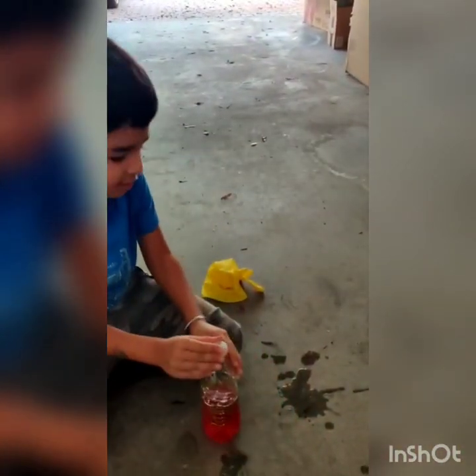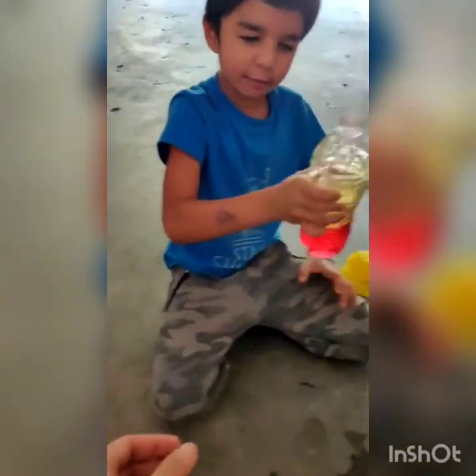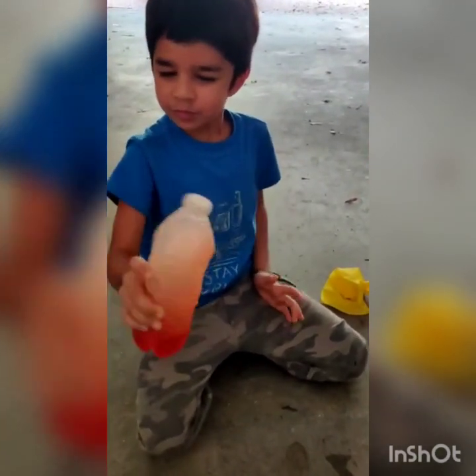Step 4, close the cap and shake well. They're separate right now, right? Let's see what happens when you shake it up. And don't shake it up and down, shake it sideways. Or shake it sideways. Okay, maybe even up and down a little bit. I'm just trying to not let it spill. It's a good shake, man.